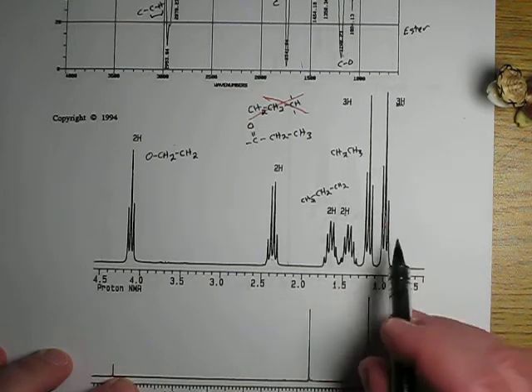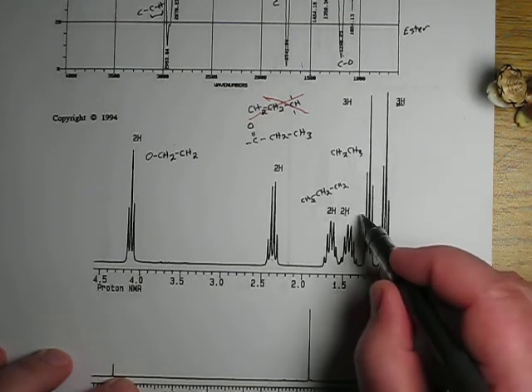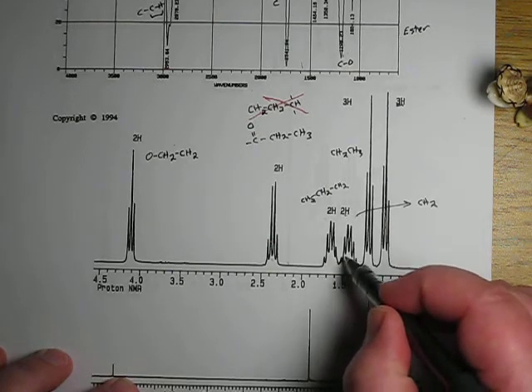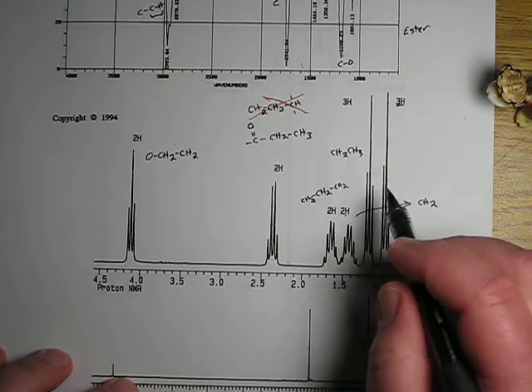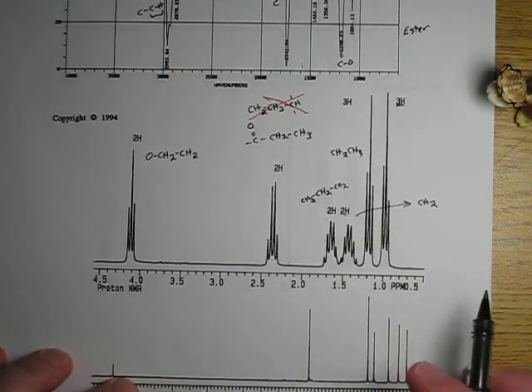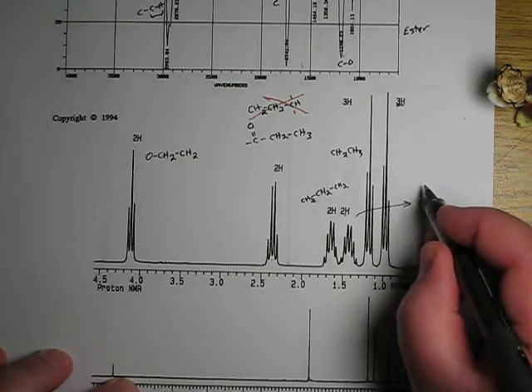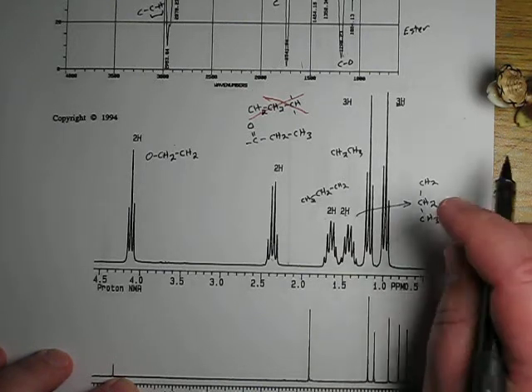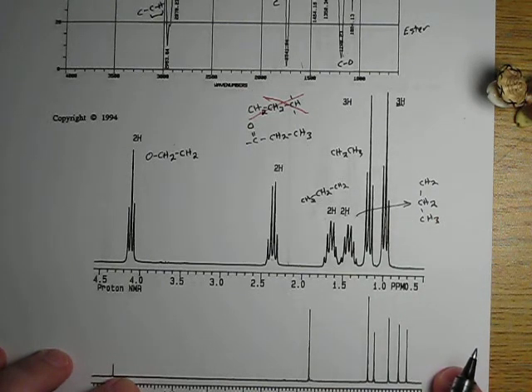Let's look at this one. That's another CH2, but it has 1, 2, 3, 4, 5, 6. 6 peaks means 5 neighbors next door. Probably a CH2 and a CH3. That's how we can get 5 neighbors next door.